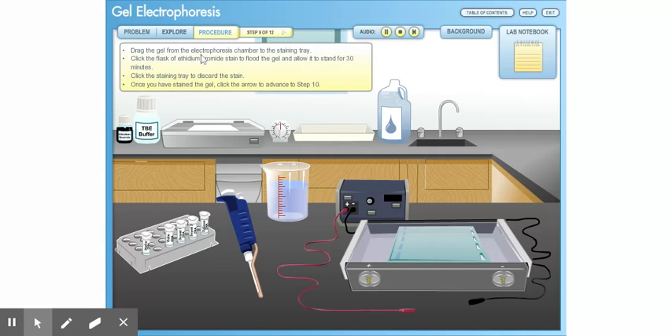Drag the gel from the electrophoresis chamber to the staining tray. Click the flask of ethidium bromide stain to flood the gel and allow it to stand for 30 minutes. Once you have stained the gel, click the arrow to advance to Step 10.